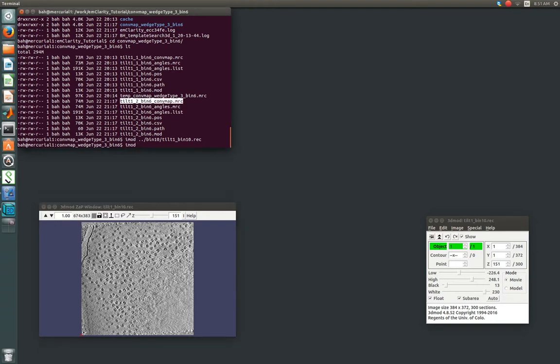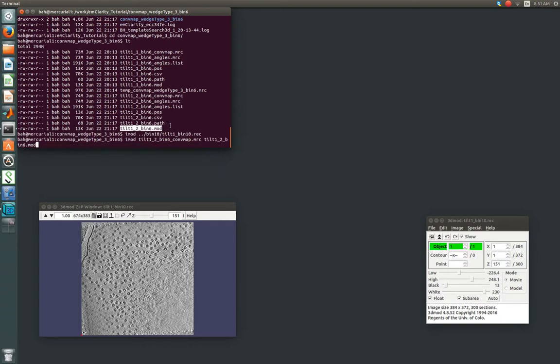A handful of files were generated, so everything for tilt1 tomogram2 is what we're going to be looking at. So we've got the cumulative convolution map, and then also the model file, which stores the xyz coordinates for the origins of each subtomogram that has been found.